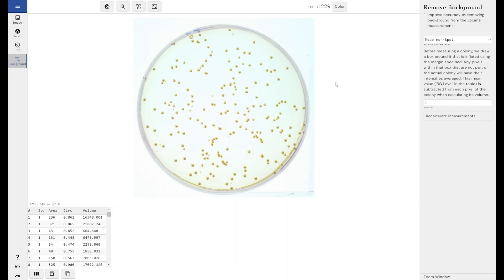We do also have the mode non-spot background removal method. What this does is for every colony, it expands an invisible border around the colony of this margin.